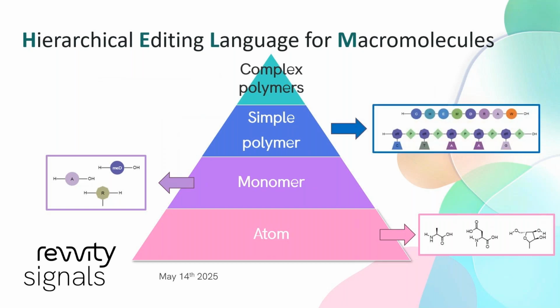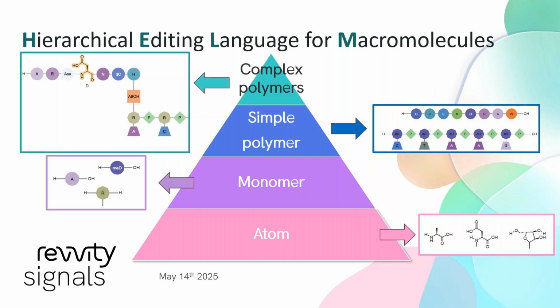Of course, one of the first things you can do is to create a simple biopolymer with it, like a peptide or an oligonucleotide, and that's what you see here represented in blue on the right hand of your screen. Eventually, if you connect together these polymers, you would create this so-called complex biopolymer. And here what you see in this tile box is actually on the top a peptide that is connected to an oligonucleotide at the bottom through a chemical linker represented by this orange box.